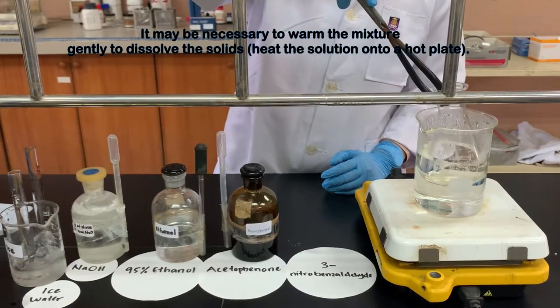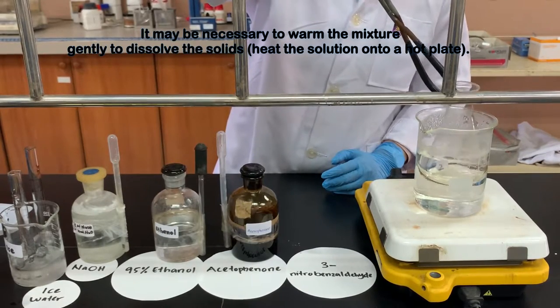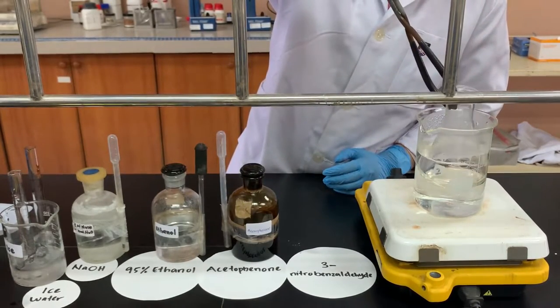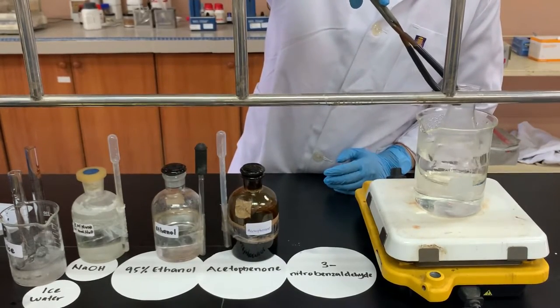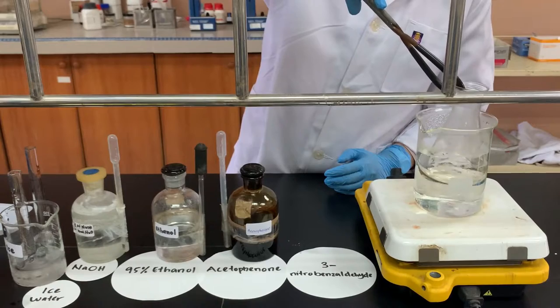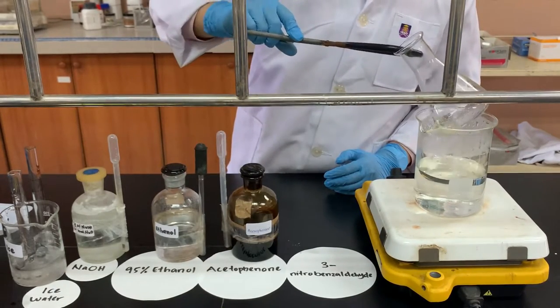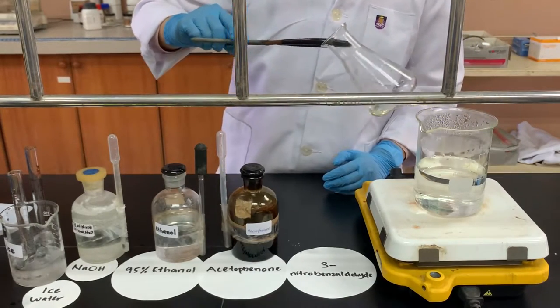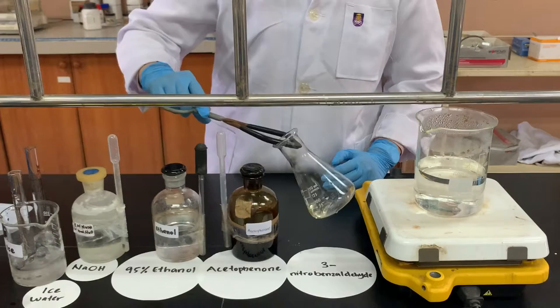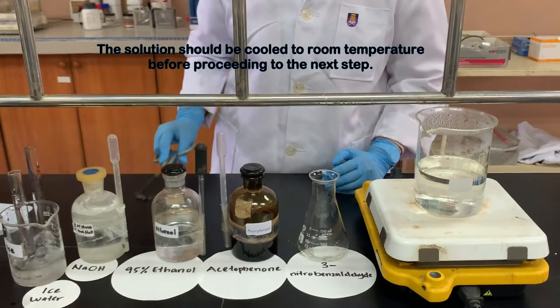It may be necessary to warm the mixture gently to dissolve the solids, or heat the solution on a hot plate. The solution should be cooled to room temperature before proceeding to the next step.